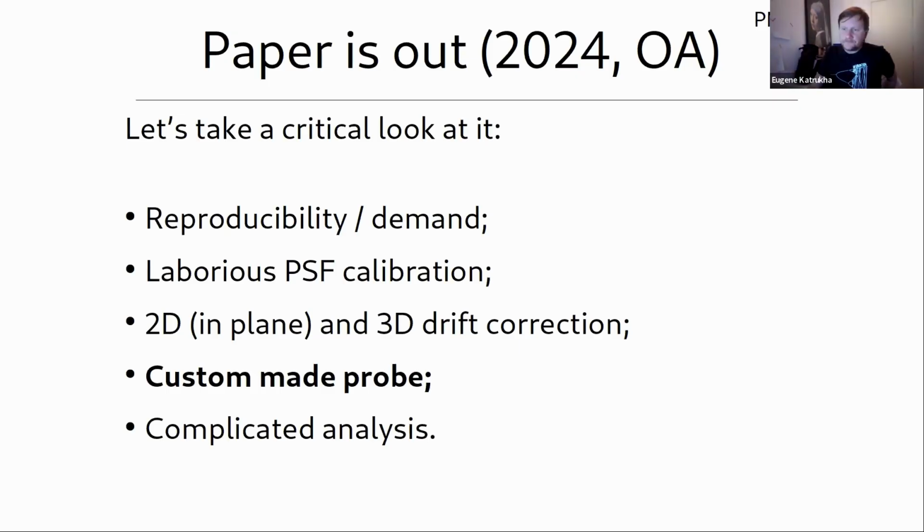And the last point on the critics list is the custom-made probe. Indeed, we had to purify the kinesin, and there are no updates about that. We don't plan to make a company selling this, but in principle the protocol is described.